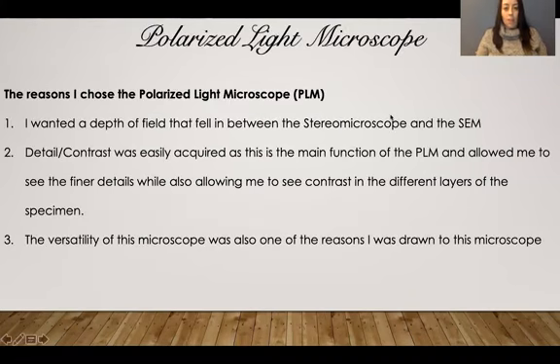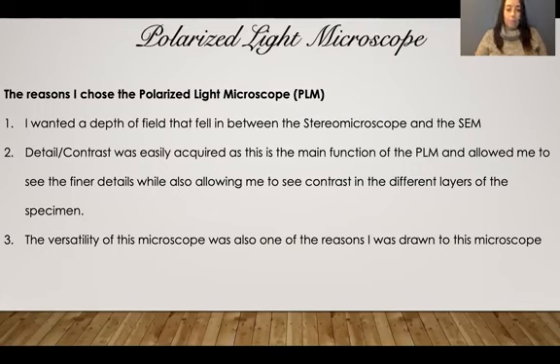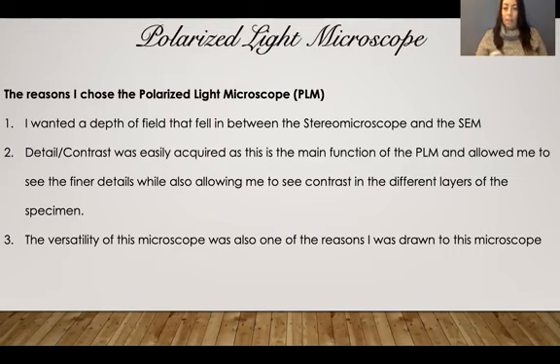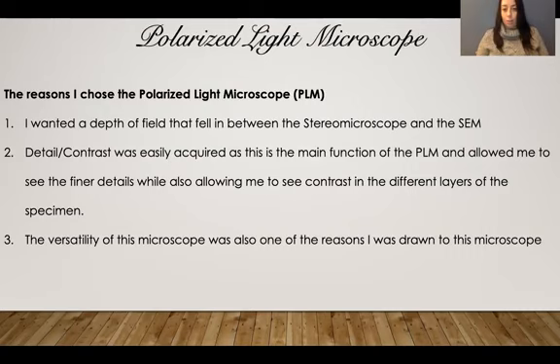My sample is viewed under the polarized light microscope. There are a few reasons why I chose this one. First, I wanted a depth of field that fell in between the stereo microscope and the SEM. The stereo microscope made the overall pattern of my sample quite obvious and I wanted to get a little bit more detail that isn't quite visible to the naked eye. However, the SEM did go a little too far, so something in between — the polarized light microscope — was perfect.